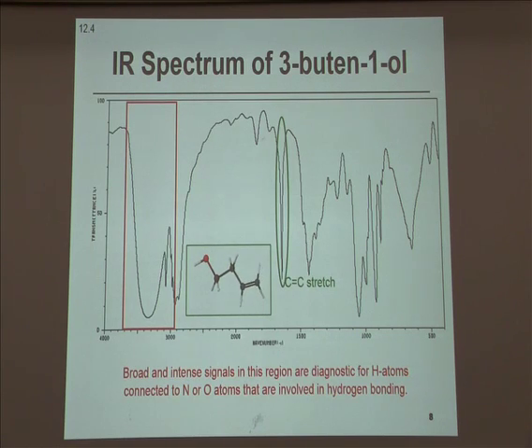So important from this line is this idea of hydrogen-bonded OHs being very broad and very intense, and a good way to identify OHs or alcohol groups in a molecule.